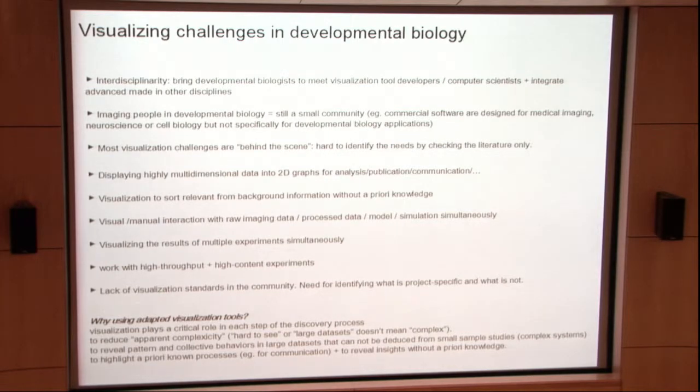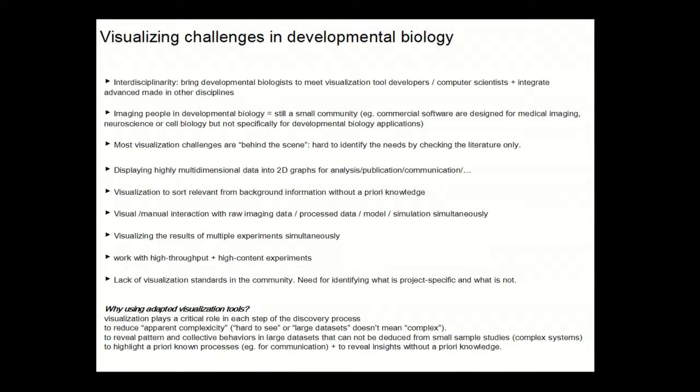And why should we improve the visualization tools? First, it can reduce the apparent complexity. I wanted to really point this out because it's not because it's hard to see or because you have a large data set that it's complex. Maybe by using the right visualization tools, you realize that it's actually simple. And it was actually the case for the fly embryo imaging.